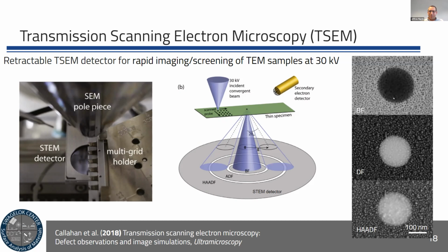In this case, this is a polystyrene sphere on top of gold nanoparticles. And in this case, you could get a pretty good idea of the average grain size of the nanoparticles without actually going to a full TEM. But in this case, you would get a better estimate than just regular high resolution SEM.